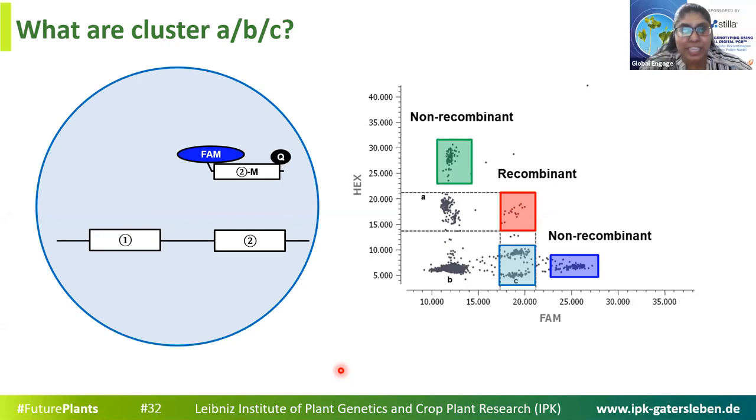So the last question for today: how were individual nuclei isolated from different pollen for this study? Well, the nuclear isolation was done mechanically, and the method for isolation itself for all these different crop species was done in the same way. We just collect the pollen, we mechanically grind it, and then we filter it with certain sizes of mesh, and then we get the isolated pollen nuclei. So this was very easy, and if you want to see a more detailed procedure, you can check my paper. Yeah, I guess that was the last question.